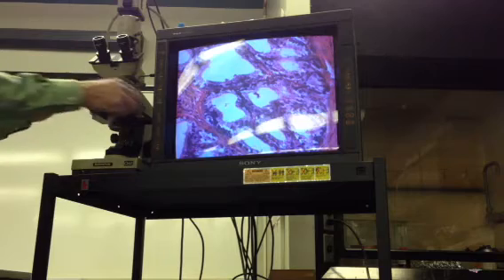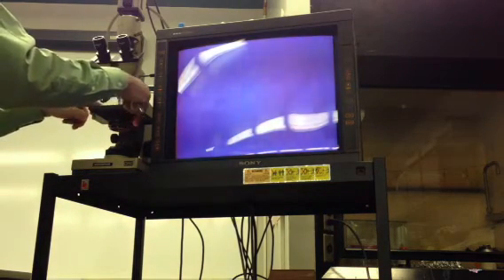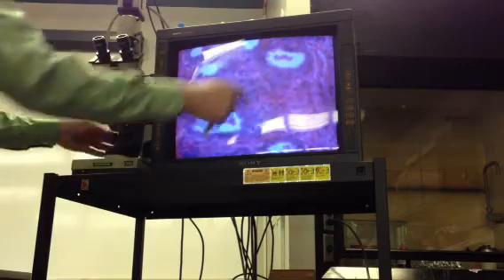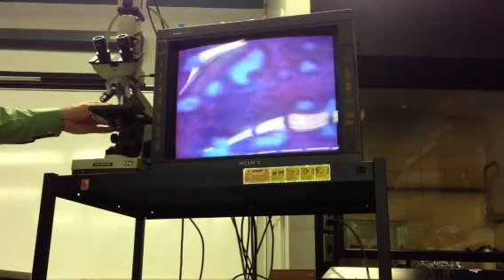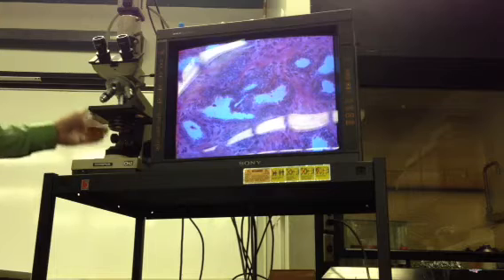Got a picture? And the way that you tell that different from the prostate is that the prostate has a lot of tissue in between. That's the stromal one. And also, remember there was an error in the book. This is the corpora amylacea, right? But remember, in prostate you have relatively smaller glandular sections, lumens, and a lot of stromal tissue.